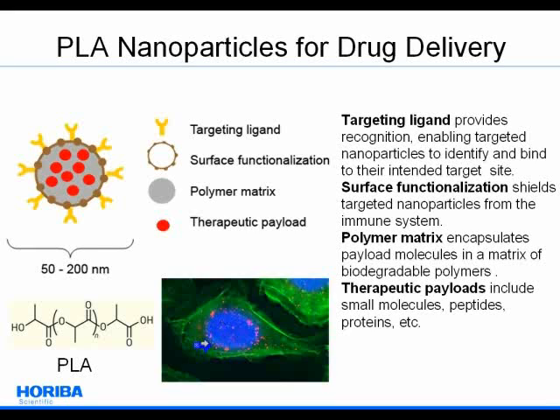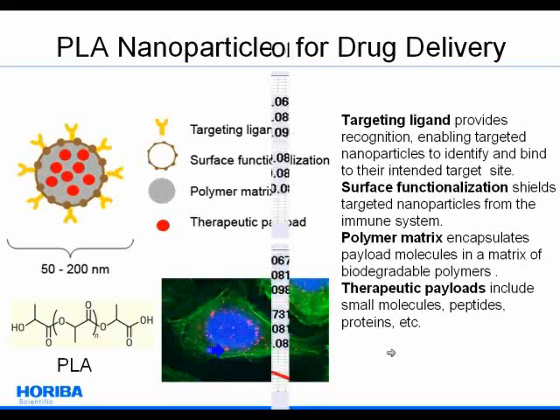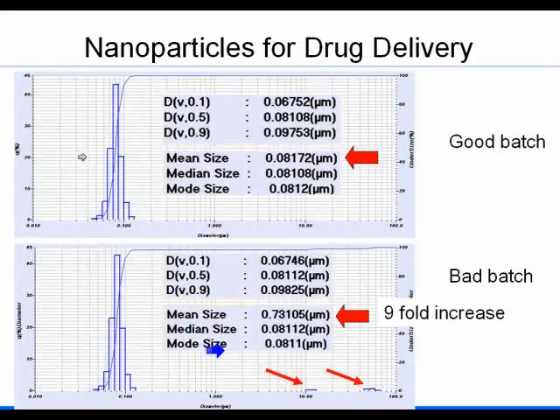And there's also a lot of work on nanoparticles to be able to actually track the motion of these particles as well. I've seen data for nanoparticles that both deliver it and also act as tracer particles. Here we're probably looking at a fluorescence. Maybe these are quantum dots or something like that. So that we can not only deliver the particles, but also find ways to trace, was it delivered to the specific site. This is LA 950 data for PLA nanoparticles.